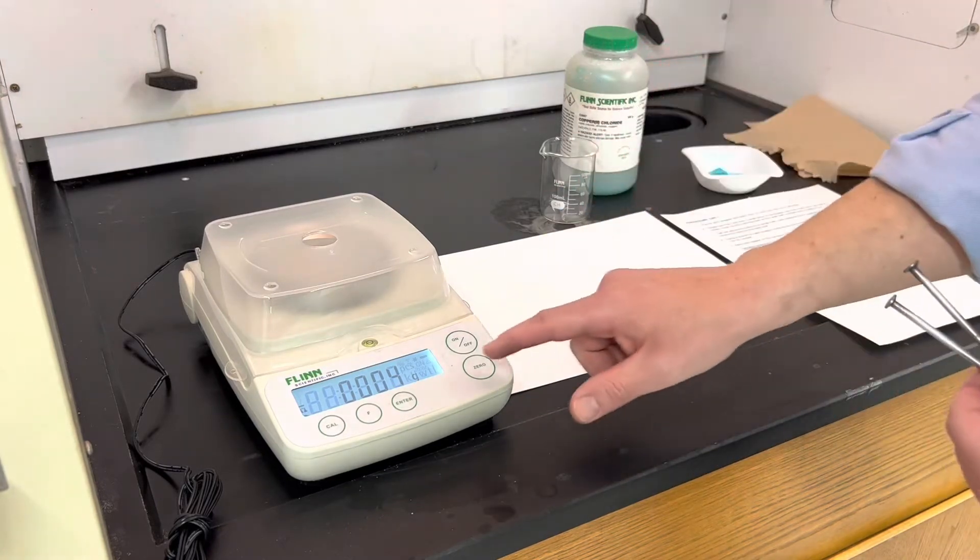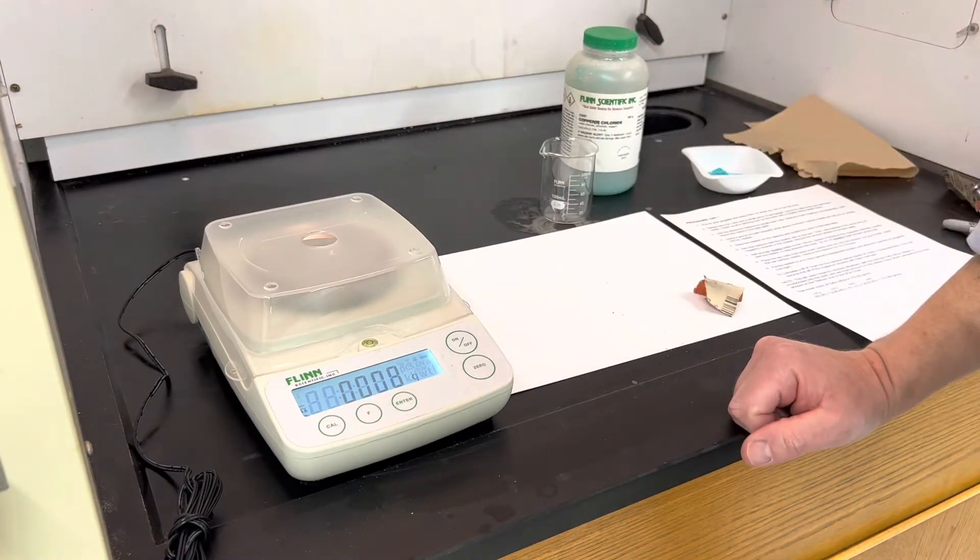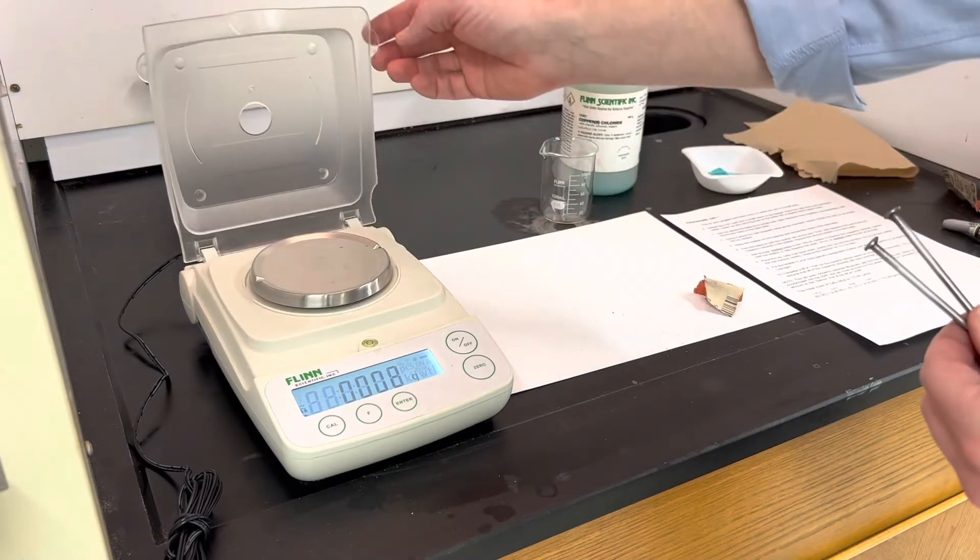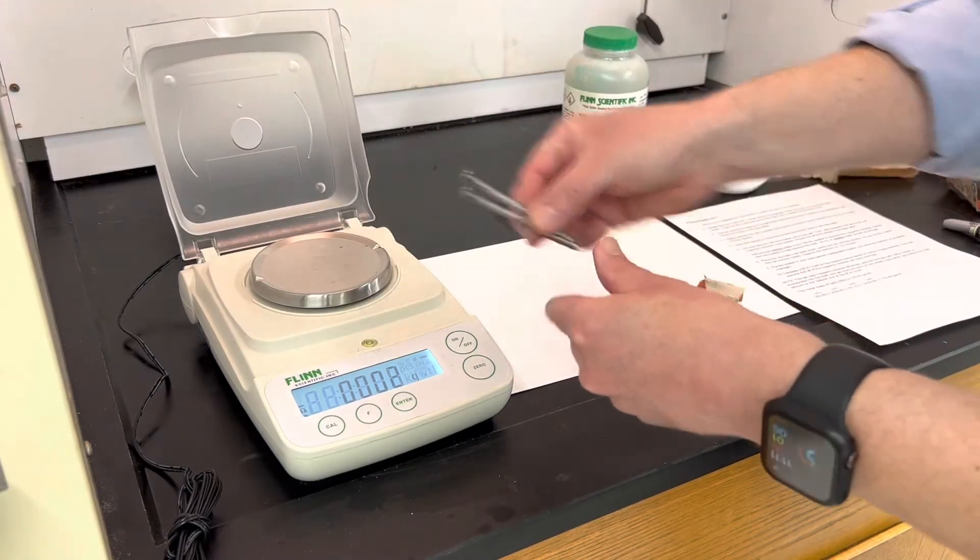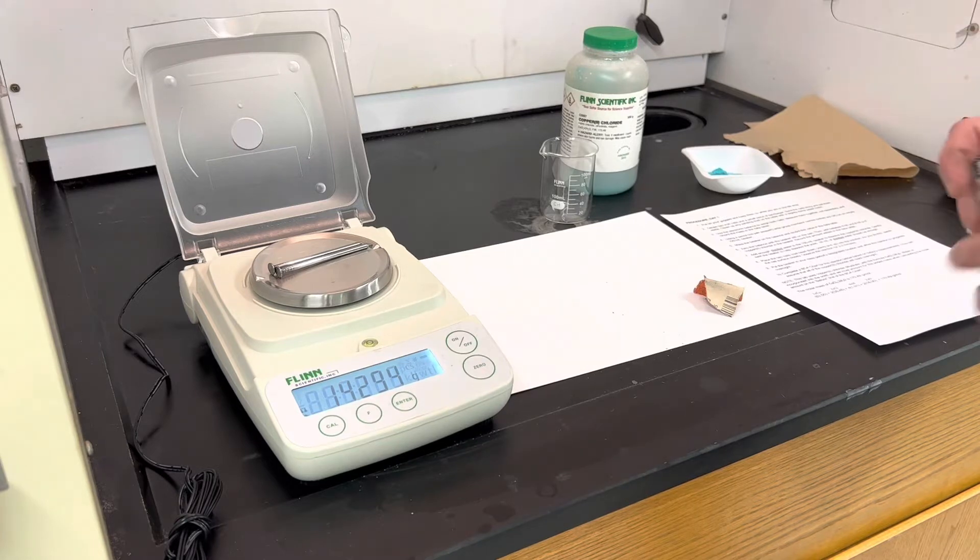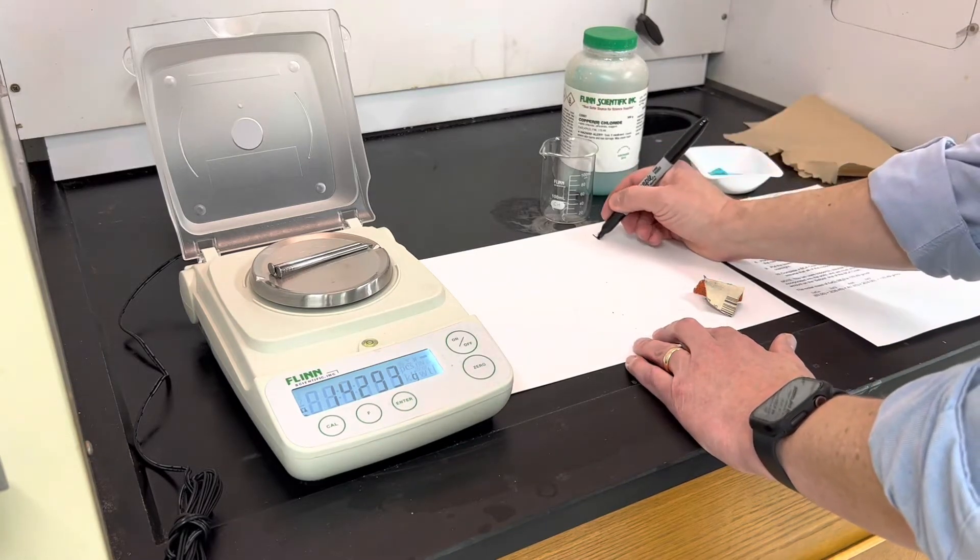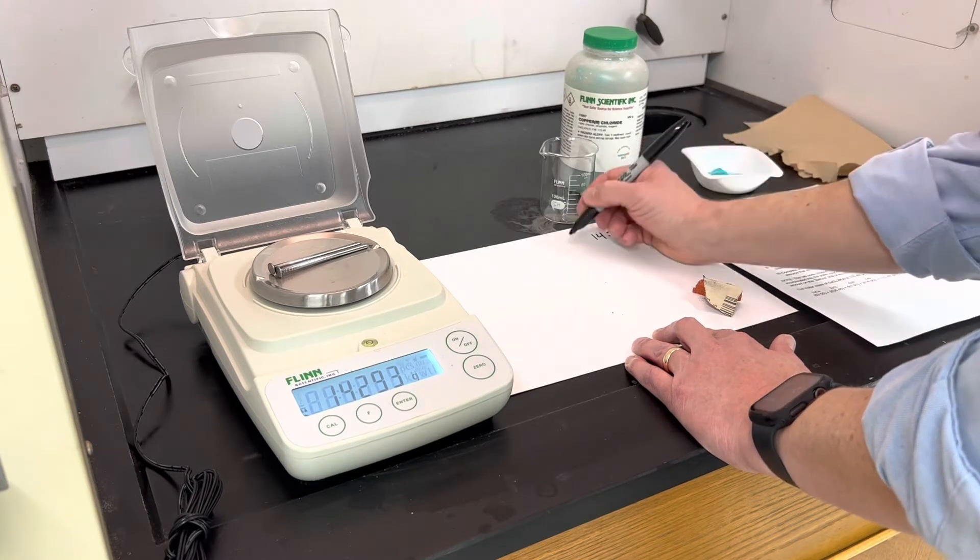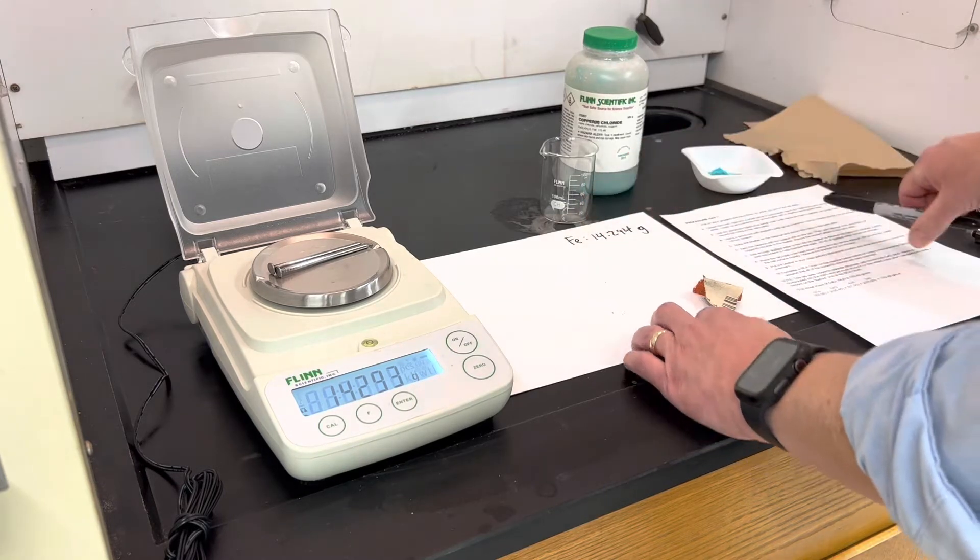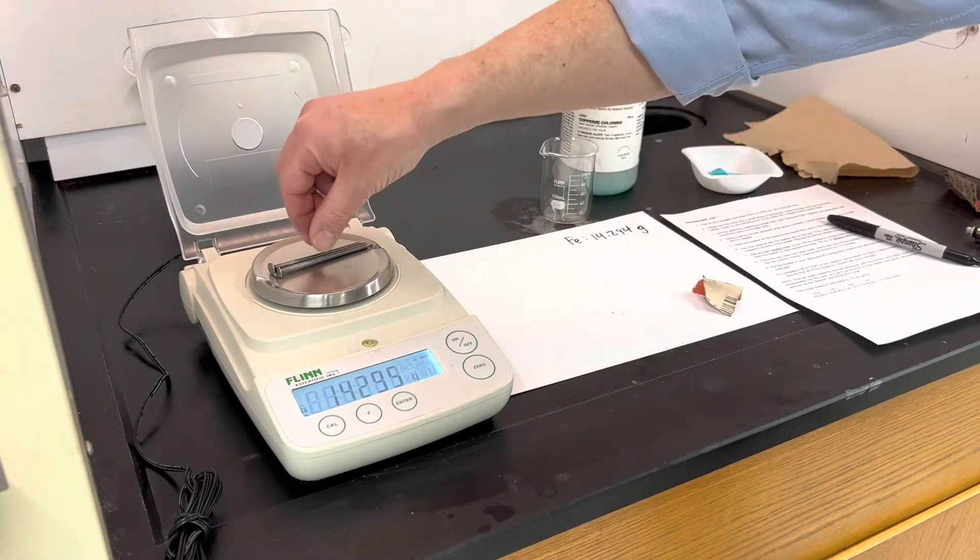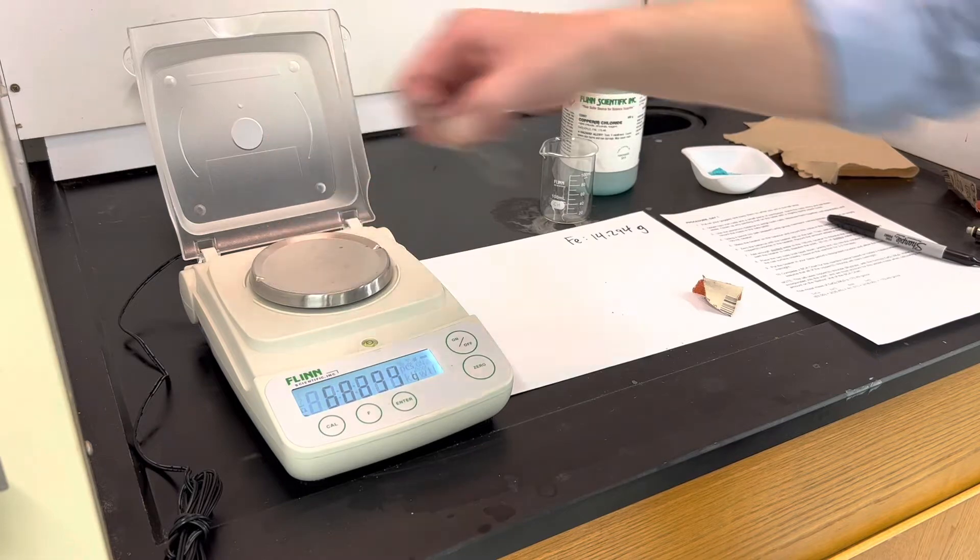Next I want to get the mass of these nails. So I'll make sure my balance is zeroed. This is our most sensitive balance so it fluctuates a little bit. And I'll go ahead and put those on the pan. And I'm going to jot down that number: 14.294 grams. That is the iron. And it's fluctuated a little bit, but again, a thousandth of a gram is a very small amount. I'm not too concerned about that.